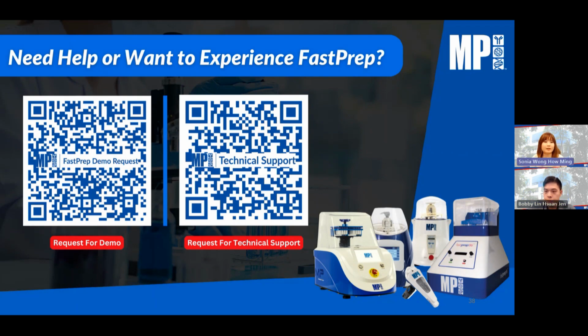Yes, I fully agree with Bobby because, of course, changing it alone without optimizing the speed and the time wouldn't be a good optimization. The reason I would recommend A or M is that, in this case, the concern was long milling time, and A and M could give you a good balance between the compaction that we need as well as the shearing that we need.